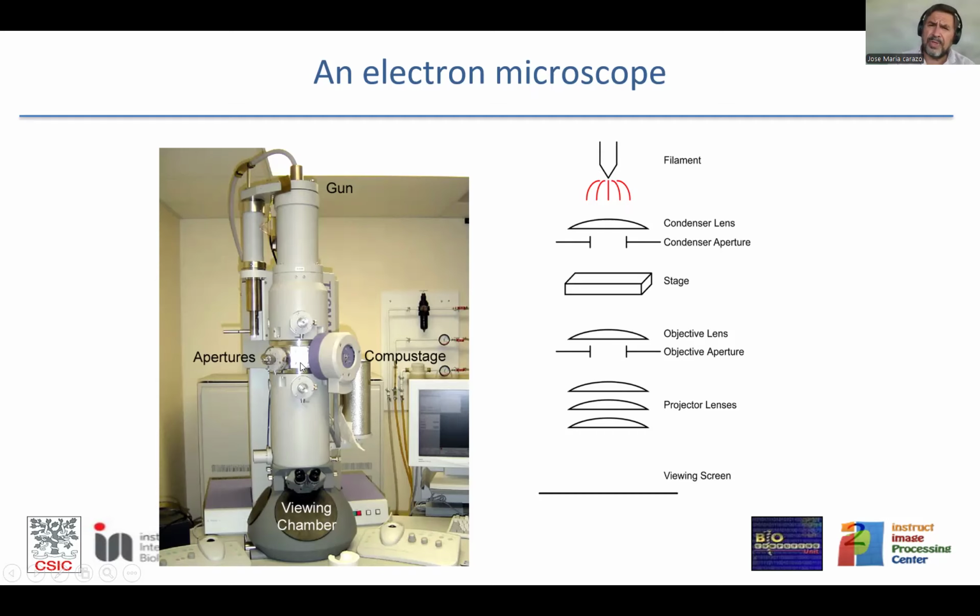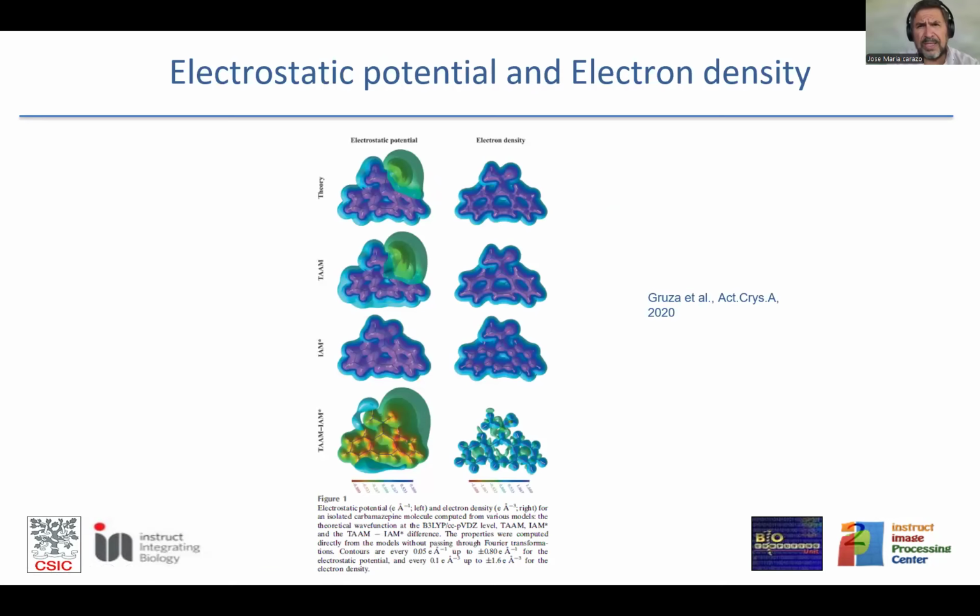As opposed to the way you normally see images, where there is a reflection and then it is this reflected light that comes to your eyes, the way to make the images that we are going to work with is by going through the specimen. And going through the specimen, we get an understanding of the complete three-dimensional structure of the specimen. Understand that we are talking of electrons.